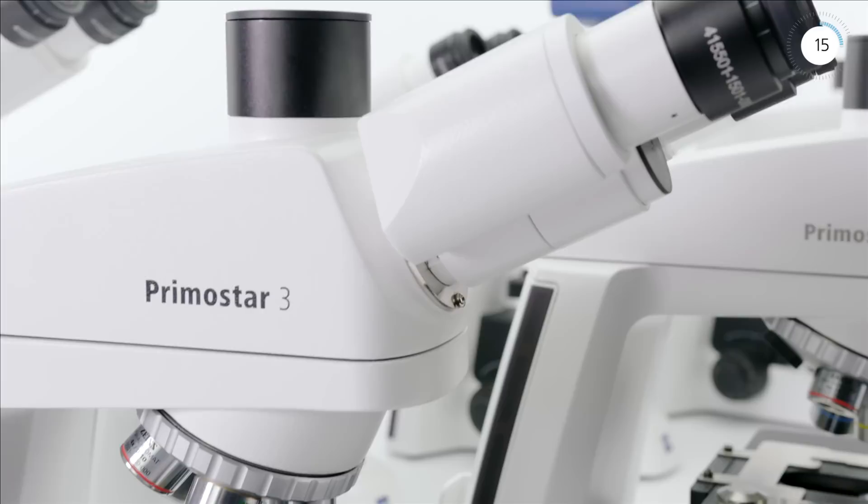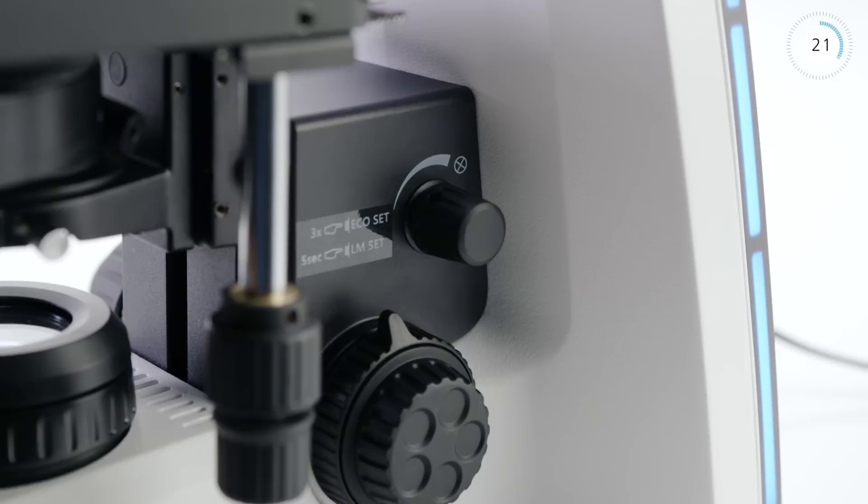Zeiss PrimoStar 3 comes in predefined packages, so you have a choice of ready-to-go combinations.